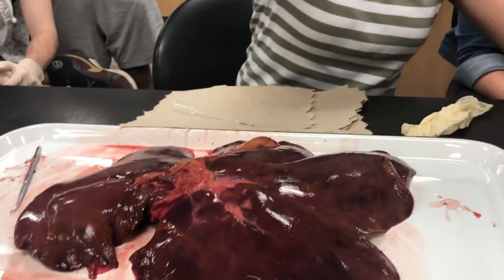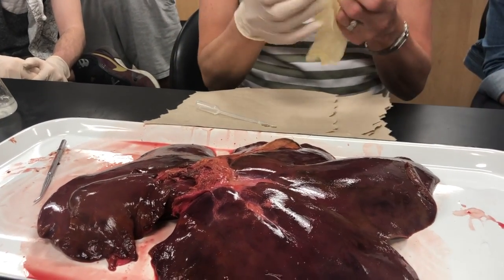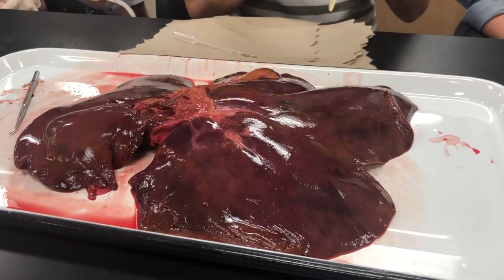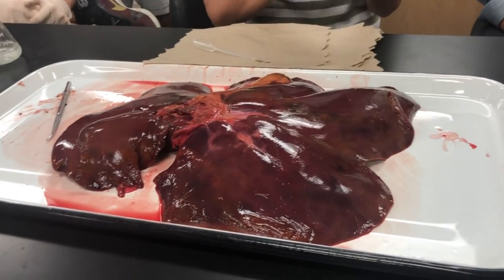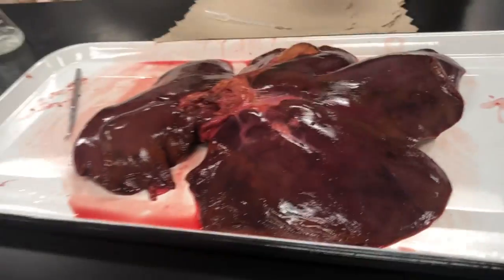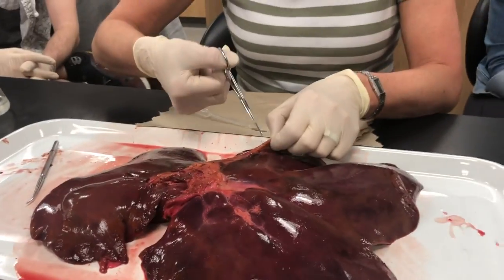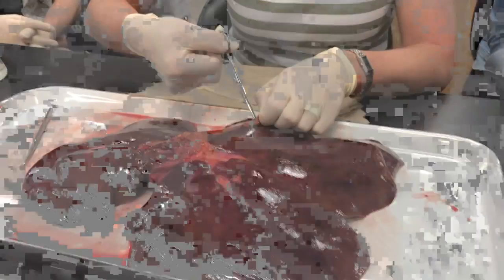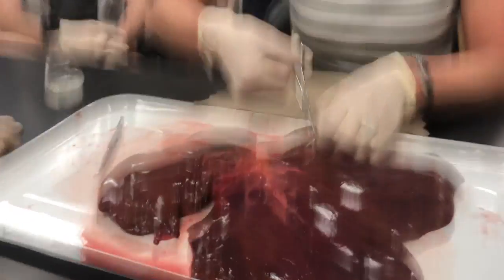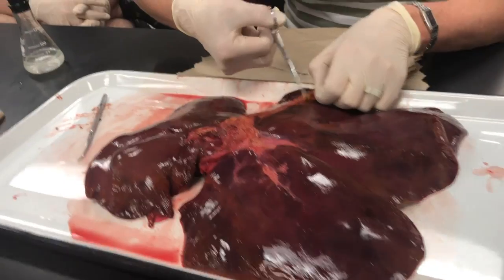And the answer is, of course it's gonna make a difference. But we wanna see it. So I need to have a scissors. Do you have one of scissors over there? Thank you, ma'am. She's like, no. All right, and so I have to cut this because there's not really a good way to get it out otherwise. Yeah, but I'm gonna stick the pipette in there.